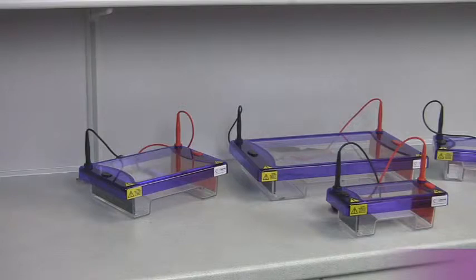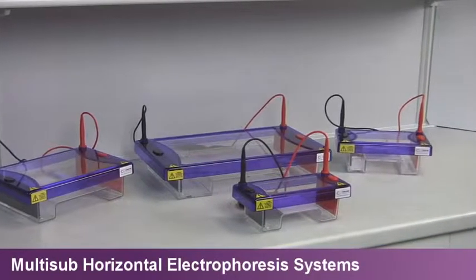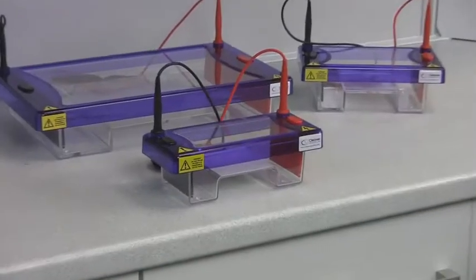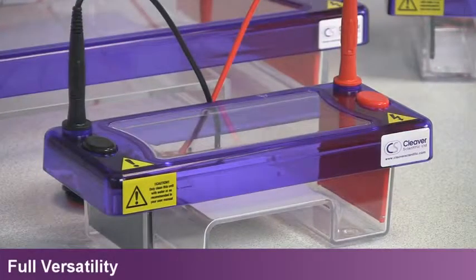Cleaver Scientific provides a comprehensive range of multi-sub horizontal systems for all your nucleic acid gel electrophoresis needs. The MS Mini Duo, shown here, is one of Cleaver Scientific's best-selling horizontals.